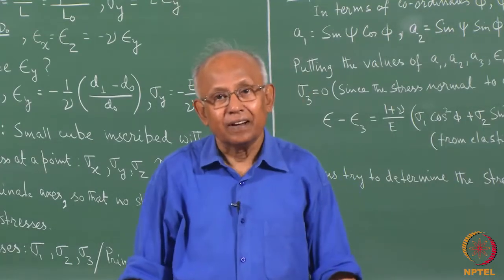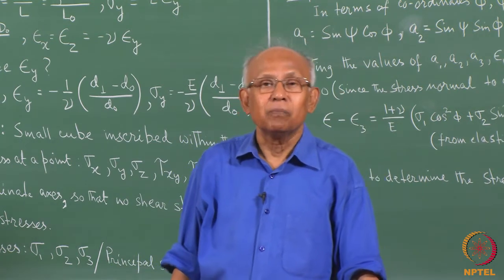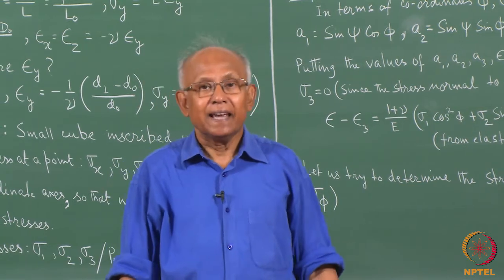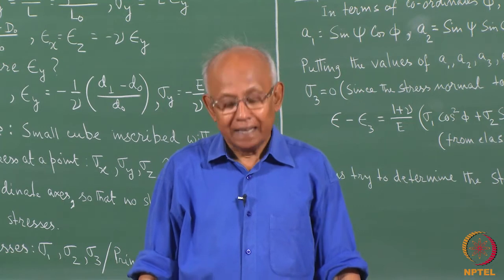In this lecture, I will deal with stress analysis by X-rays. X-rays provide a very elegant method of stress measurement in a material.